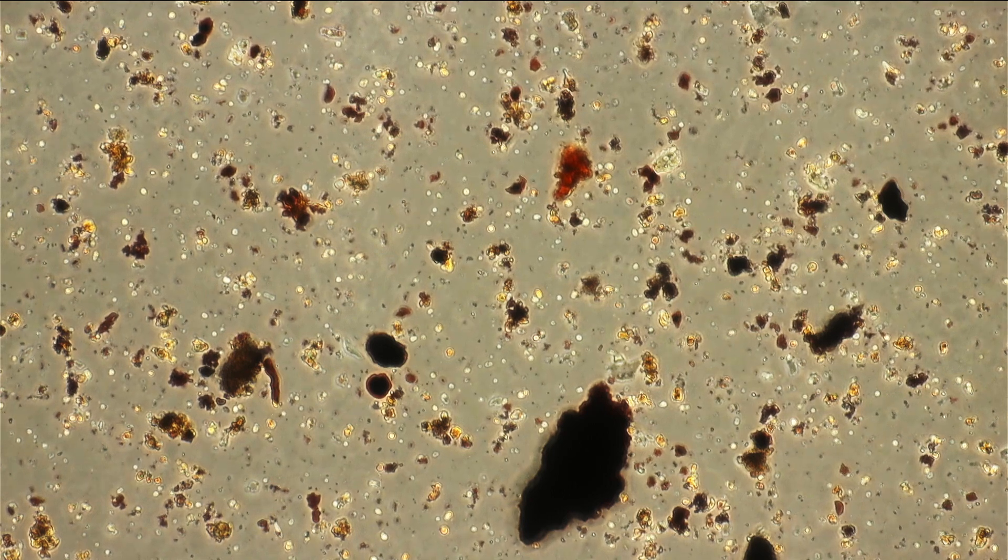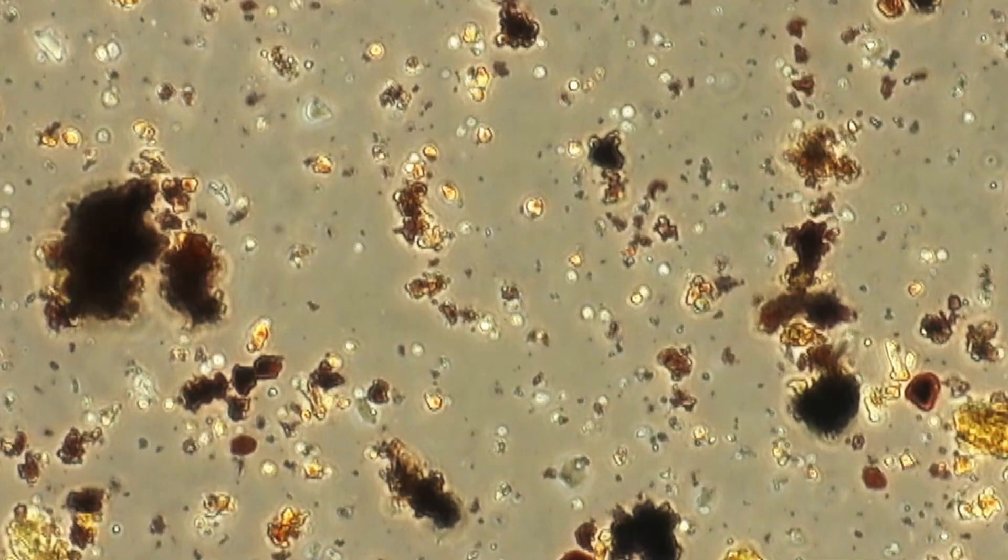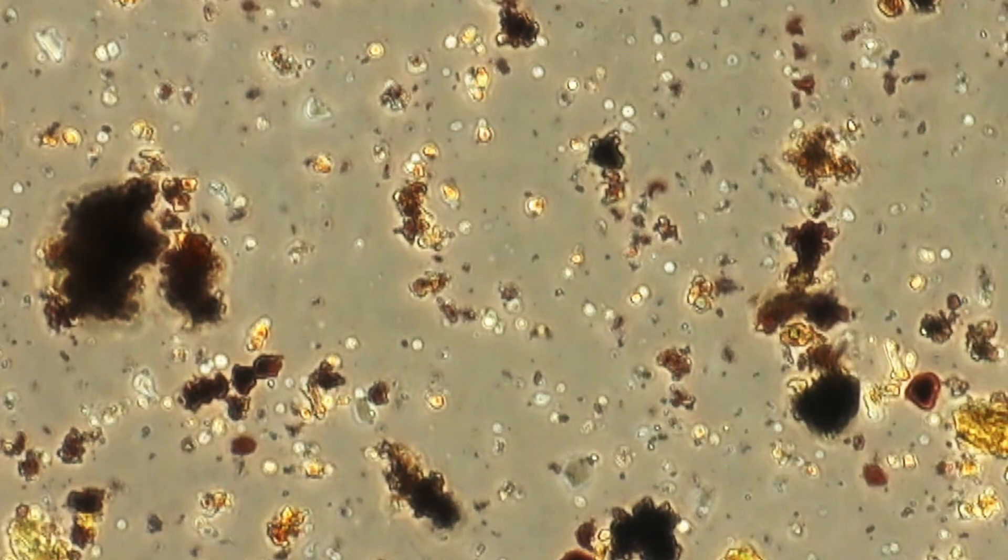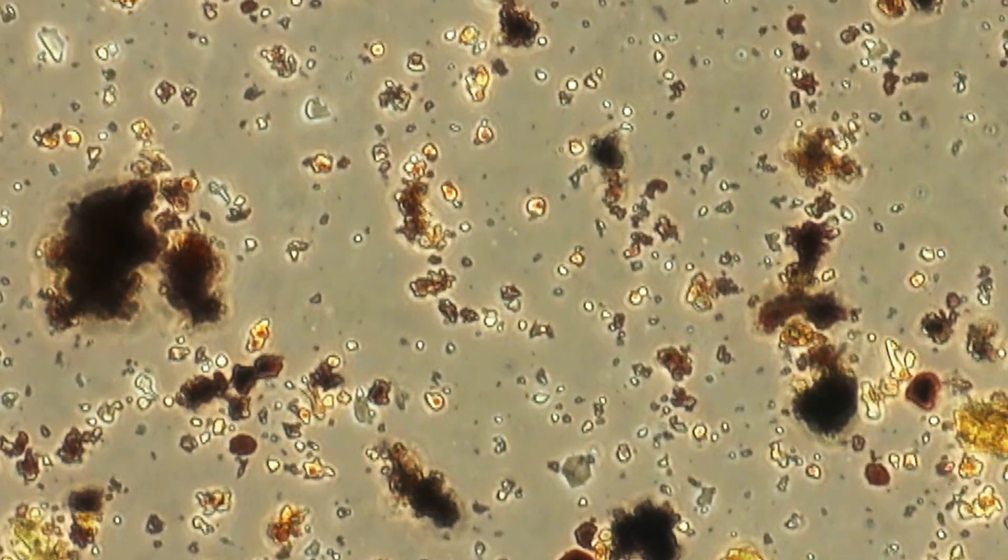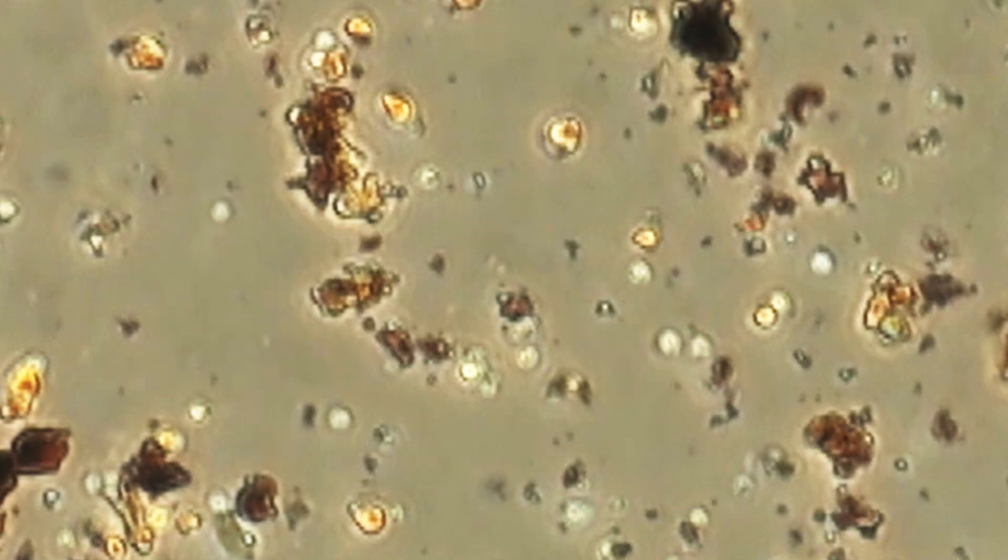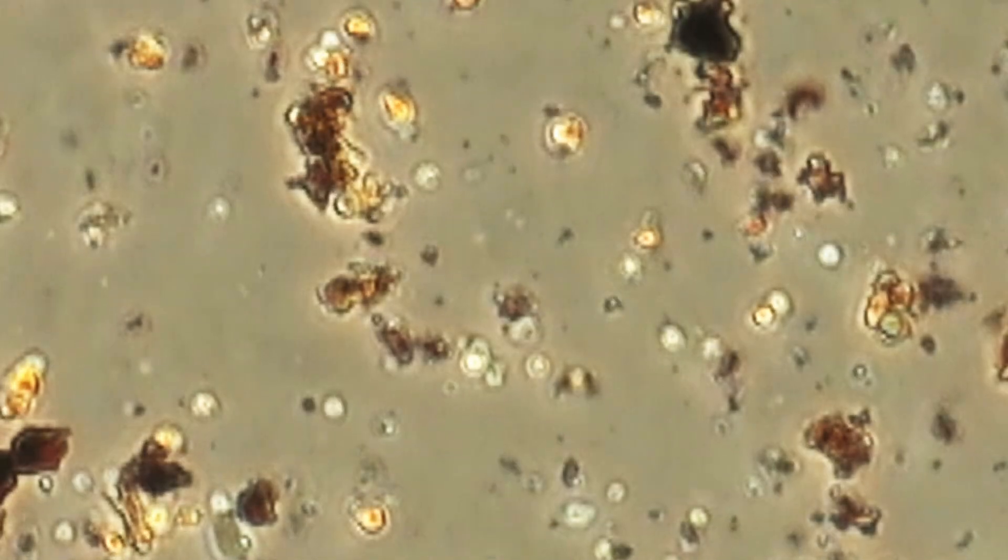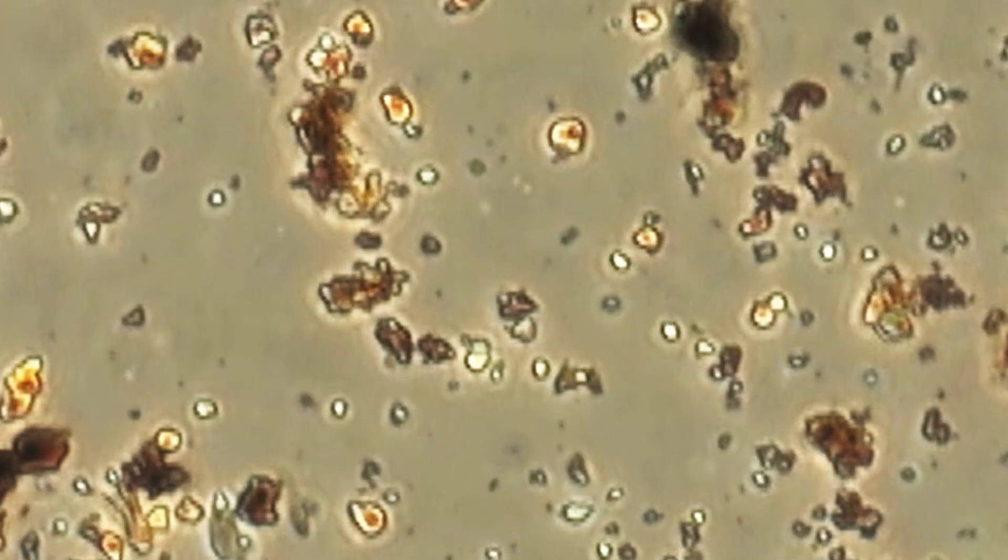There was a little bit of movement. Some of those starch grains and particles were kind of shaking around a little bit. And that is because of the so-called Brownian motion. That is the random motion of particles that you're able to see. But this is not because these are bacteria that are moving and those particles were too irregular to be bacteria.